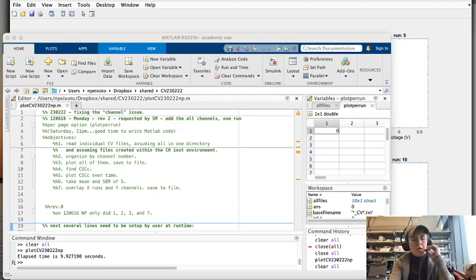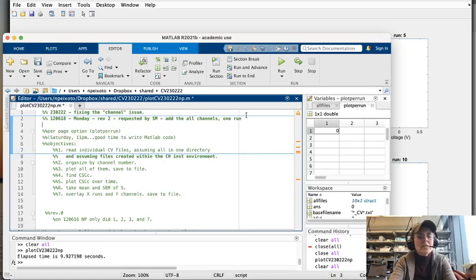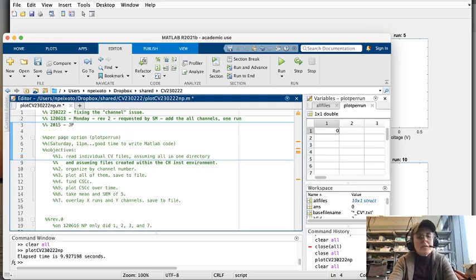Okay, so I am updating the cyclic voltammetry file to make it easier. This was originally made in 2012 for Sagantika, and then in 2015 I made it for Jose, and now it's 2023, updating this for Hassan.